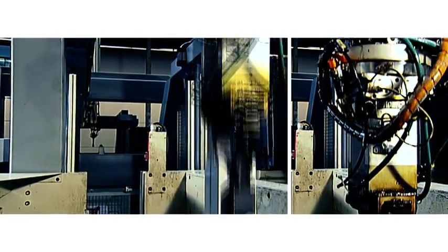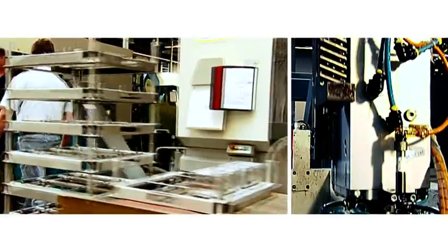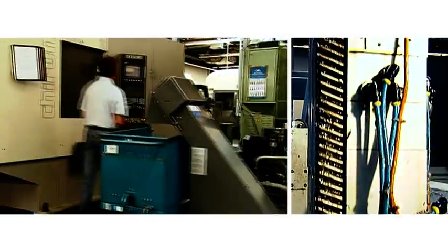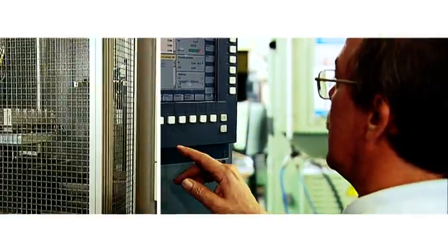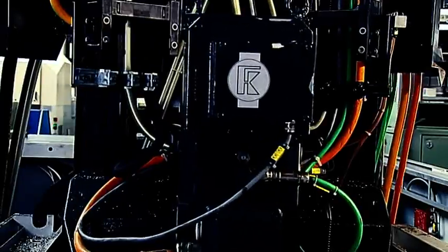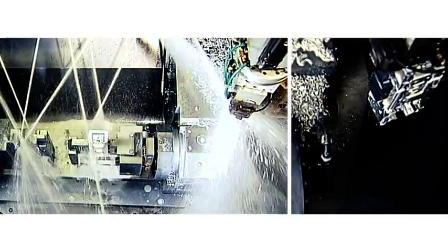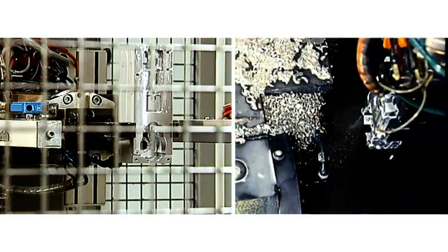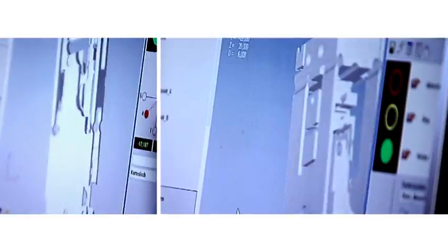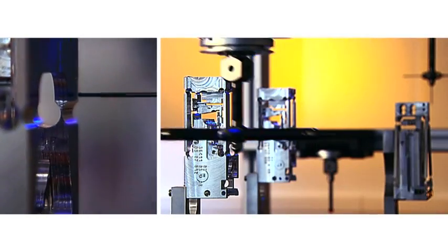What is special about the monolithic way cell is not just the fact that we can manufacture it from a single block of high-grade aluminum. It is the consistently precise machining, without the tiniest deviance, which ensures the unique accuracy of the Cubist.